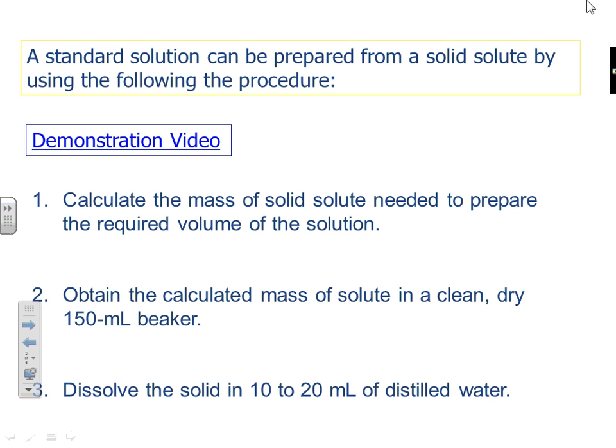Yep, good. Okay, so I want you to write down the steps. A standard solution can be prepared from a solid solute by using the following procedure. There's actually 6 steps, so you can write this slide down, and then we'll get the last slide. And then I'm going to show you a little video that shows these steps very clearly, okay?